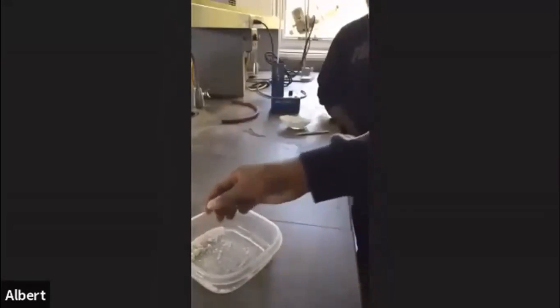So that's what we're gonna do. I'm gonna put a little bit more in here because that's not quite enough. And again, you don't want to jam it because if you do, then it's gonna get stuck at the top and it won't move. That little circle, can y'all see that? Inside of that, yeah. Just like you see those little grooves in the melt temp.